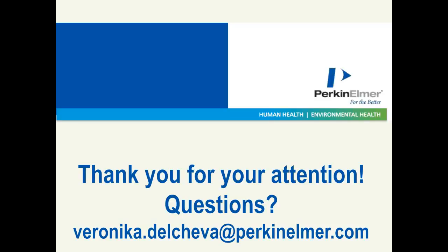I'm going to direct the next question to Sandra. The question is, can you comment on how the running costs compare between the gels that you previously ran, which I'm assuming, Sandra, were acrylamide based gels, and your current LabChip approach? I can't specifically compare the cost. It's a bit hit and miss in terms of our department because we've changed our workflow. Now we run every sample because we need that quantitation data for our next generation sequencing, so the cost would be more. Before, as I mentioned, we were only running the controls just to check that our PCR had worked, and then going ahead and doing the rest of the sequencing.